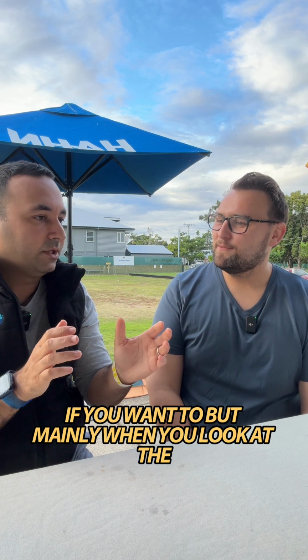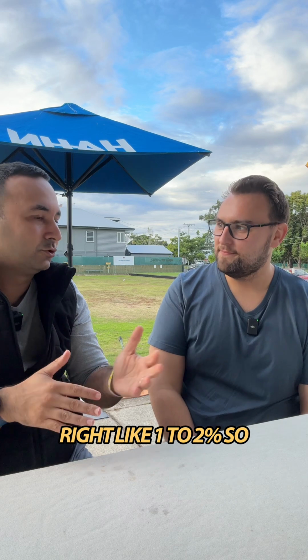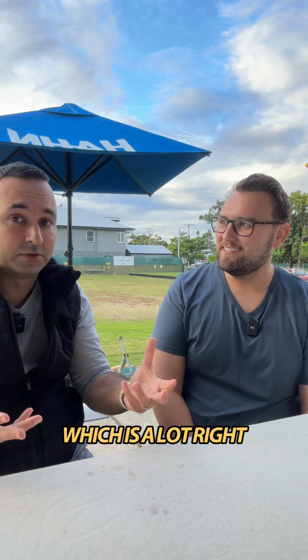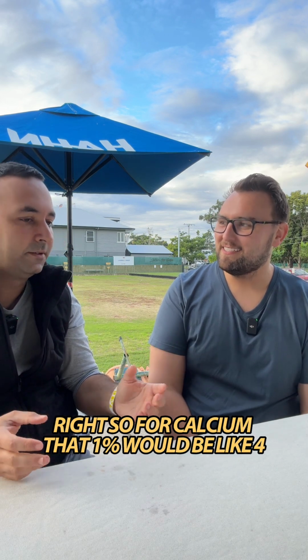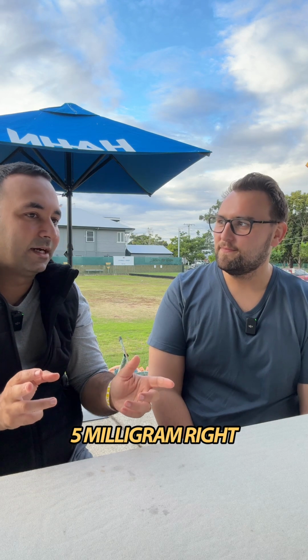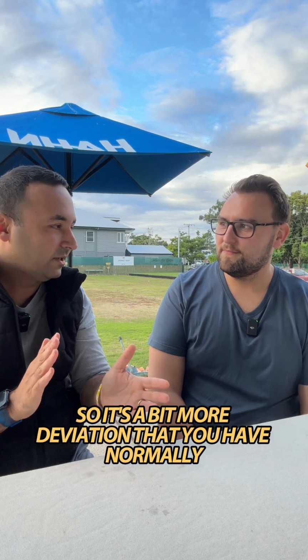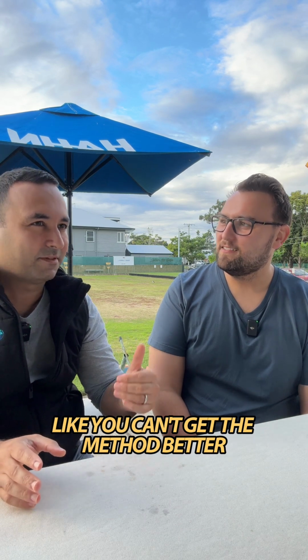Mainly when you look at macro elements, you will have 1 to 2% deviation. But 1% deviation in 10,000 milligrams of sodium is already 100 milligrams, which is a lot. If you had 100 milligrams of deviation on calcium, it wouldn't be usable anymore. For calcium, that 1% will be like 4 or 5 milligrams. Potassium is the same. Magnesium is the worst, about 17 milligrams. So it's a bit more deviation than you normally have, and you can't really do anything about it. You can't get the method better.